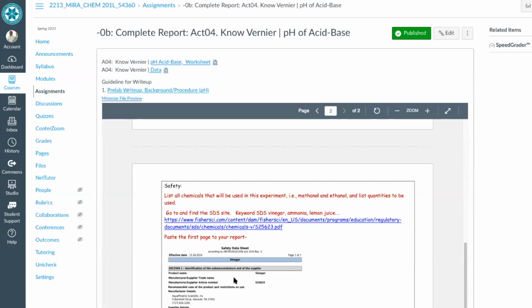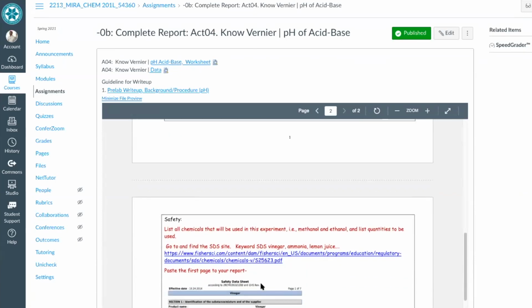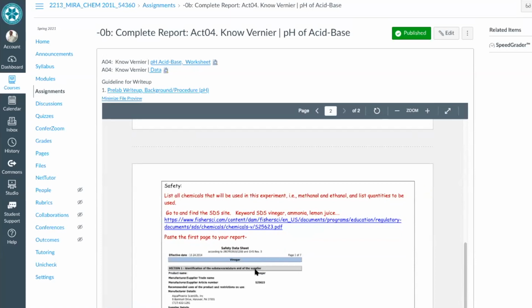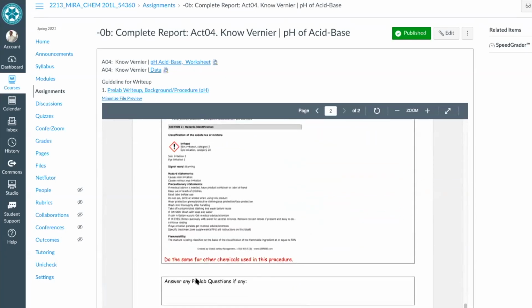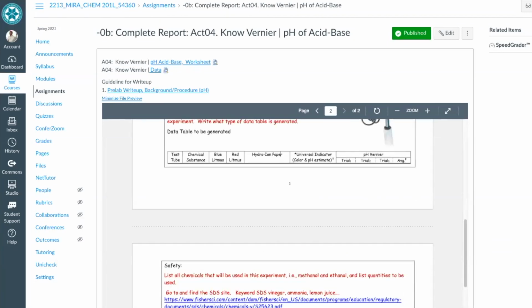For example, you guys are going to be using, I think, some of the other chemicals in here. I don't think cabbage juice is that dangerous, but try and put down some information. The quantity that's being used, again, and then the disposal. All these are chemically safe, so you can just put them in one container in terms of the disposal information. And that's basically what you would do in your pre-lab.